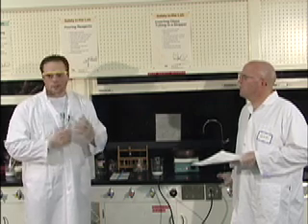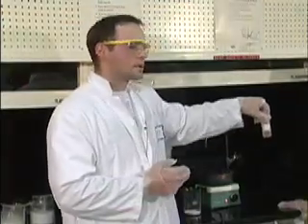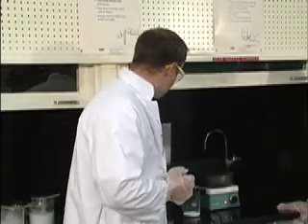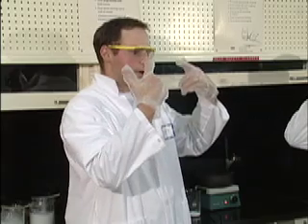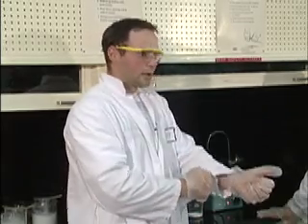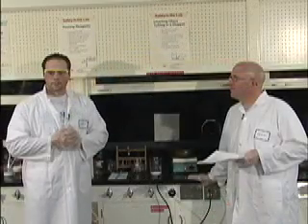So please be extremely careful when using these dropper bottles so as not to get any of this on yourself. Jeff and I are wearing polyethylene gloves and eyewear. Make sure you're wearing polyethylene gloves and eyewear. We also highly recommend that you find a lab coat or wear long sleeves for this lab.